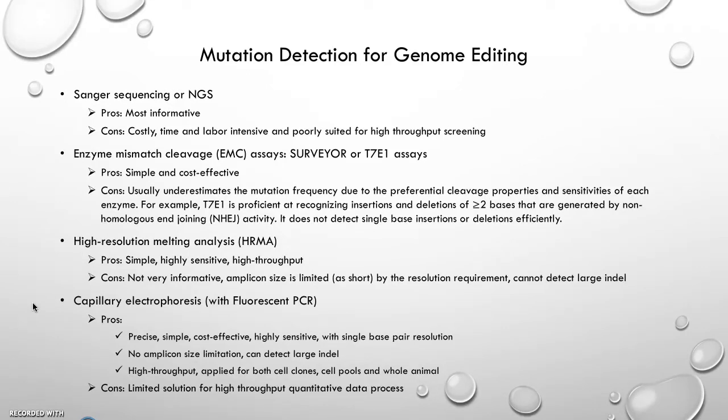Although HRMA is a high-throughput approach, it only provides limited information. There is also limitation on amplicon size because of the resolution requirement.